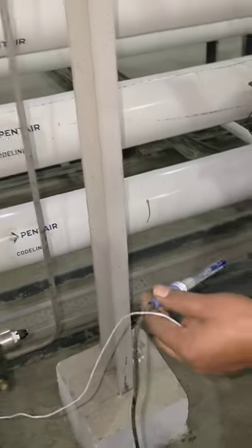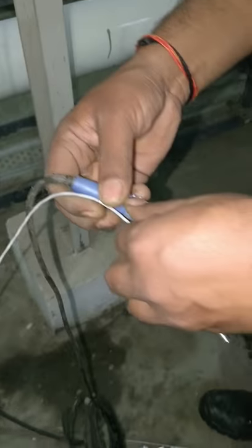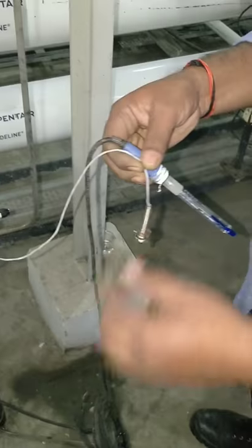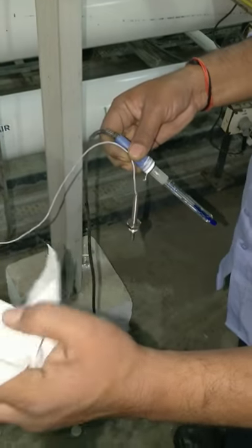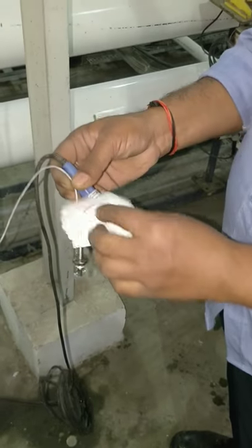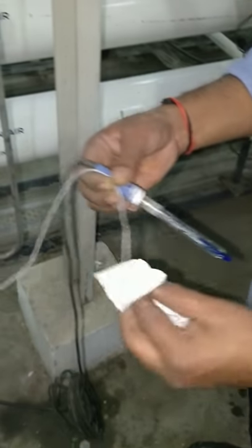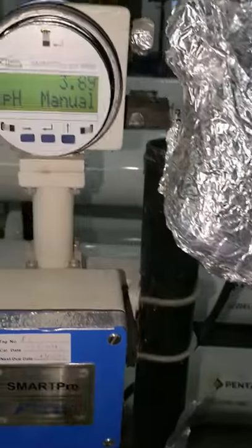We must be ready with the PH probe and RTD removed from the flow chamber. This is the flow chamber, this is the PH transmitter probe, and this is the one for RTD installation. Before inserting, you need to clean the probe with distilled water or DM water.